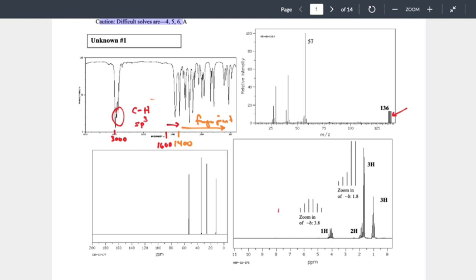So we can do a slight modification behind this. And there we go. Ta-da! Are they the same height anymore? No, they're slightly different. Which one is taller? The one slightly to the left.